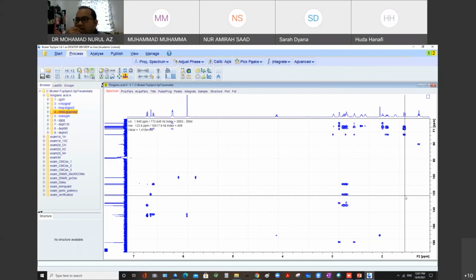Okay, for example, for Sarah, when you do condensation reactions, after that the aldehyde compound peak should disappear. If it is still there, it means your reaction is not complete or not working, for example like that. So it's very important.